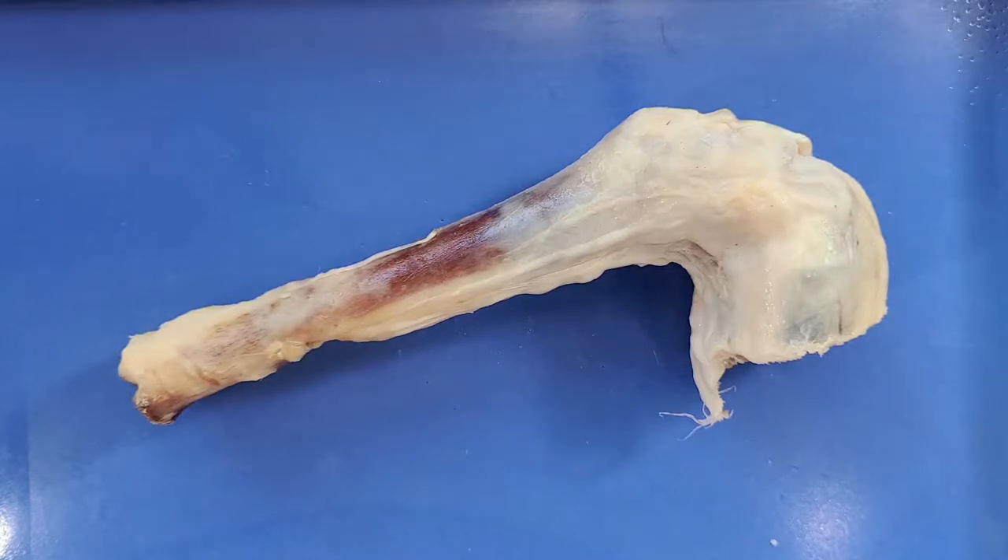What I have here is a sheep knee joint, which is very similar to a human knee joint because it has the same bones, ligaments, and cartilage. However, it does differ in that the shapes and lengths of some of these structures are a bit different.